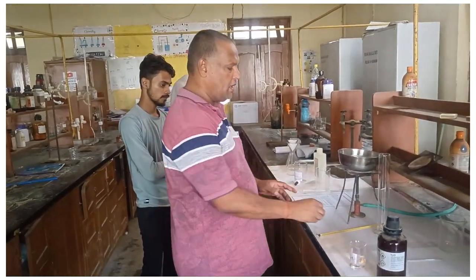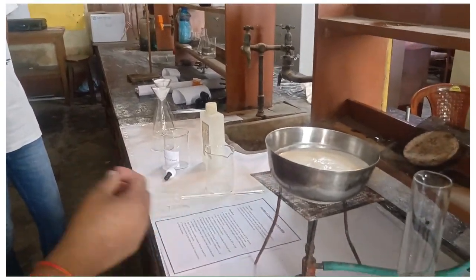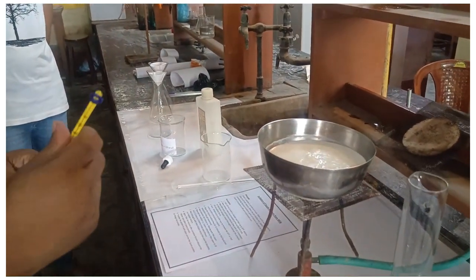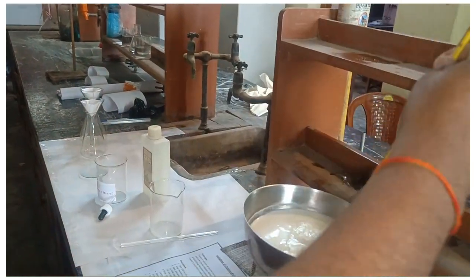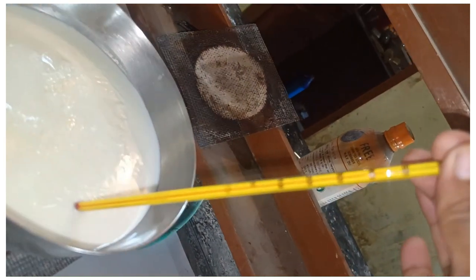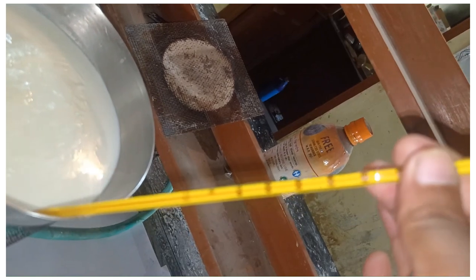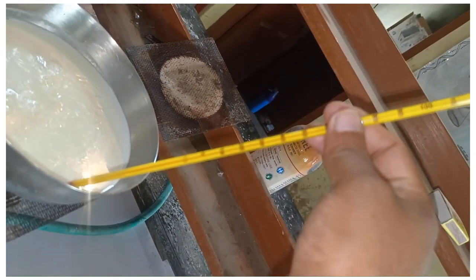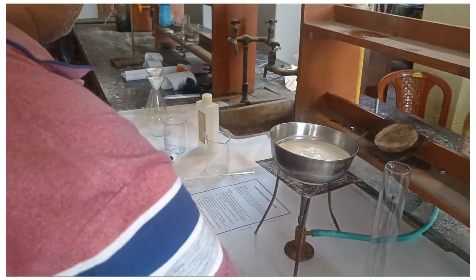At first, we have to heat the milk so that the temperature remains between 40 to 50 degrees centigrade. Then we will see at what temperature the milk reading is done. You can see the reading is about 40 to 50. Okay, the temperature is now 40 to 50 degrees centigrade.